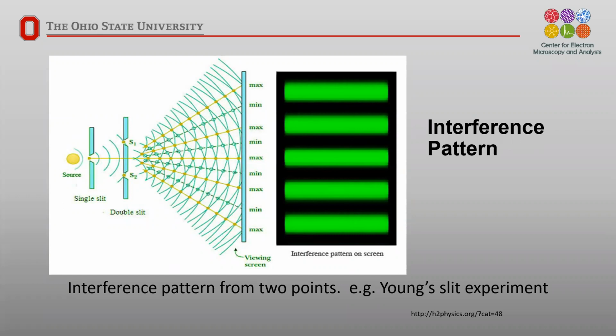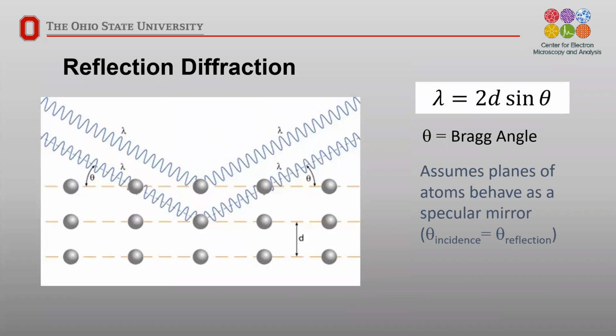Now, perhaps you have seen an illustration like this before. This is often used for X-rays, where you have waves that are in phase coming into a solid sample. As the waves strike and interact with an atom, they get scattered. And coming out, they may or may not be in phase, depending on which atoms they are striking. So in order to have them not only in phase as they come in, but in phase as they go out, you need to have an integral number of path lengths so that they add constructively.